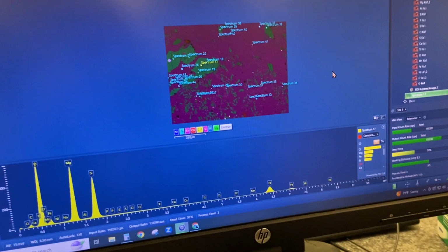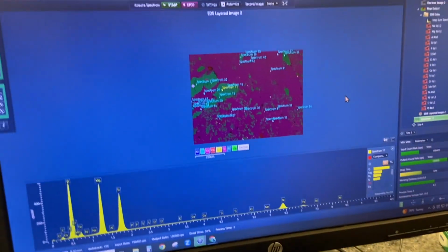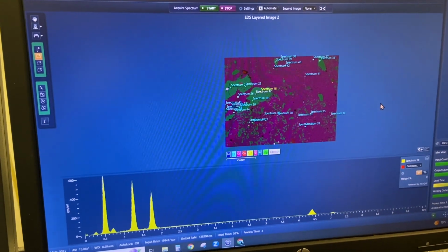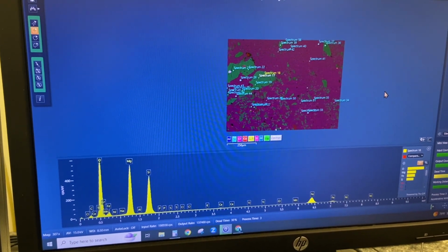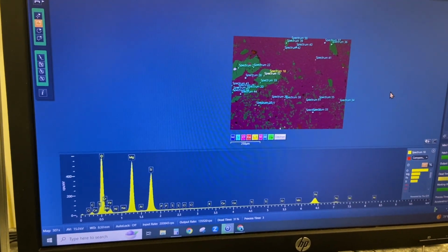So yeah, that's basically how I classify meteorites, and I would have this as probably a lunar troctolitic melt breccia. I mean, that would make sense. So I have to obviously think about that. So I'm going to keep going around the sample, finding more, but I think I'm going to end it off here. I think I've been sort of rambling on for a little bit too long, and I don't want this to be over an hour in total.